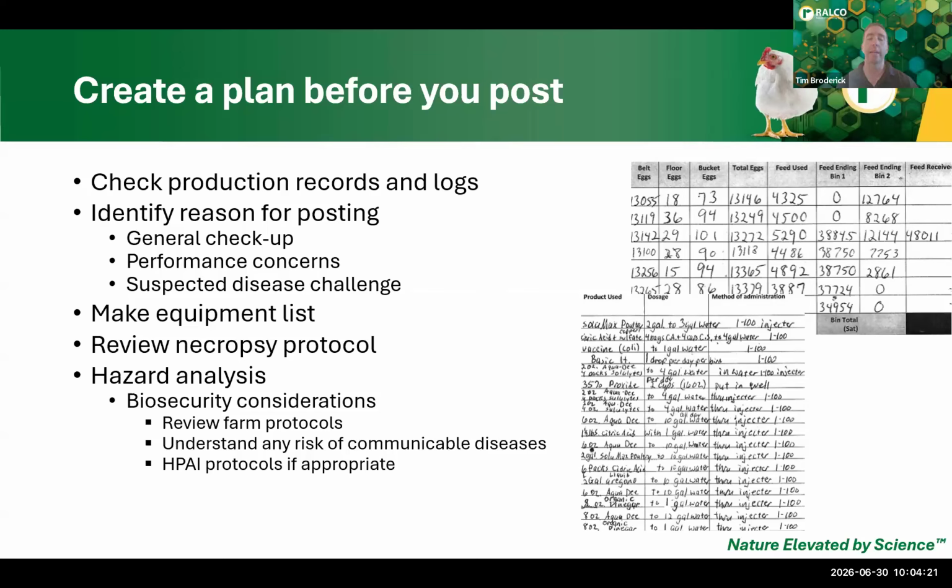From there, we want to make sure that before we go on farm, all of our equipment is there and we're reviewing our protocols. When Aaliyah walks through more of the actual tools and techniques for posting birds, it's really important that you do it regularly and maintain protocols and procedures that you're comfortable with. Everybody has their own procedures as well as different ways that they prefer to look at the birds. And it's important to just be comfortable so that you have an established baseline and understand that you can hit all those benchmarks that you need to.